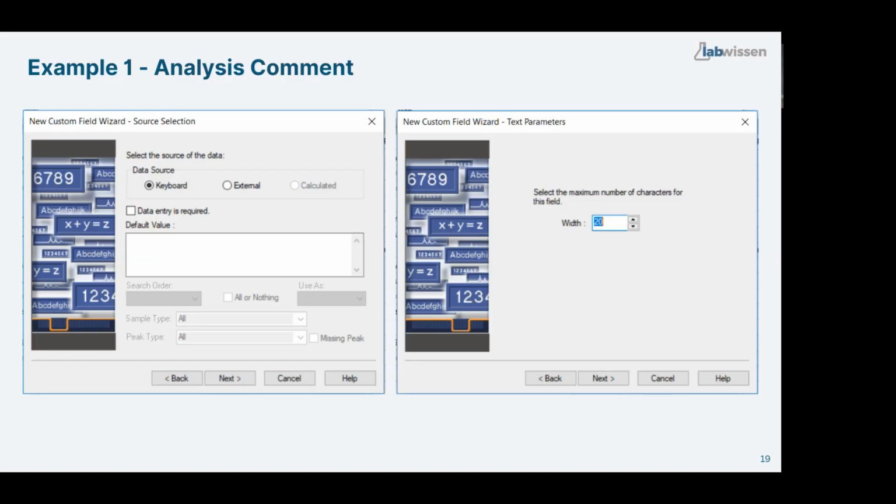But really think about it, because once you have created the custom field, documented it, worked with it, and put it in your working projects, and you find out that 20 is not enough for your regular comments, it's quite annoying to change all the things. But it's possible to modify it. This one is possible to modify.